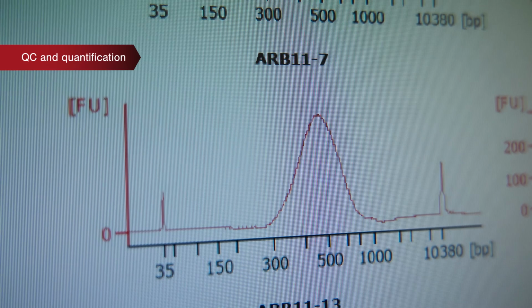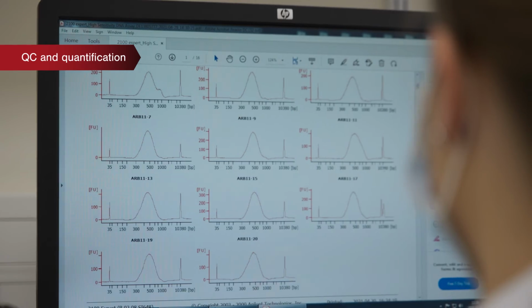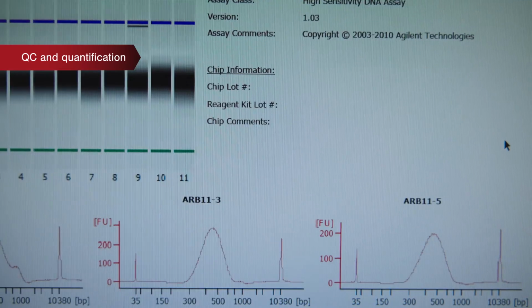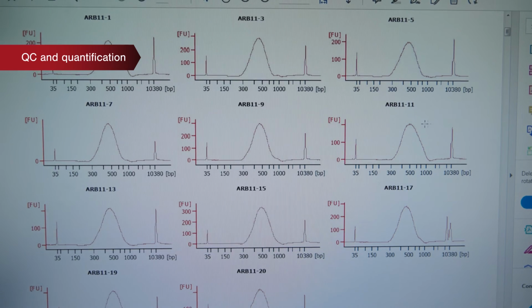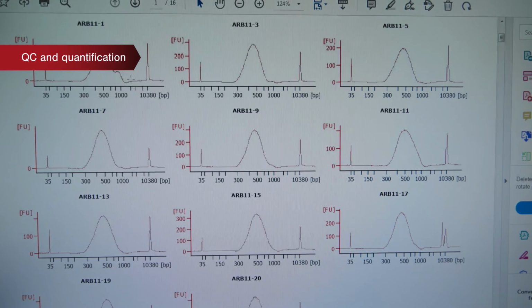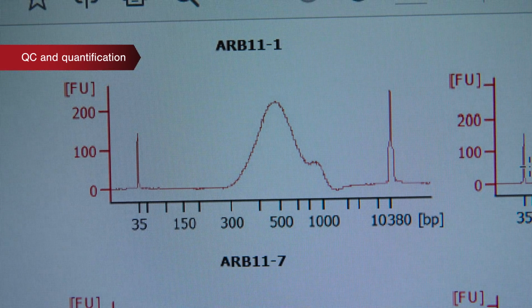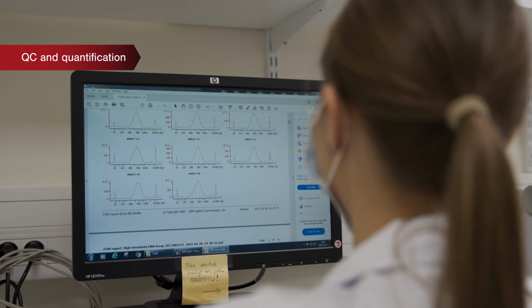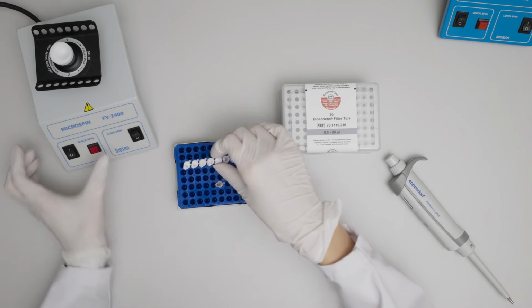Under the influence of the electric field, negatively charged DNA and RNA molecules move through the polymer filled in the chip in the direction of the positive charge at different speeds, which are determined by the length of the fragment. Length markers are used to determine the exact length of the fragments, which in the figure are peak 1 at the beginning and the second one at the end. After the quantification, another normalization can be done in order to ensure that for the rest of the steps the same amount of DNA will be used across all of the samples.